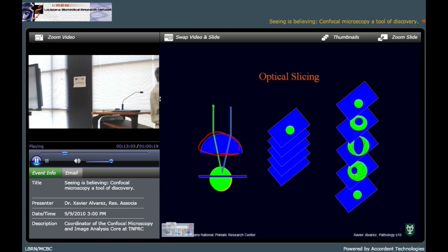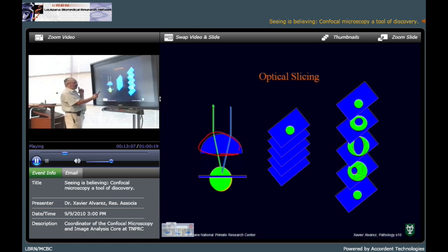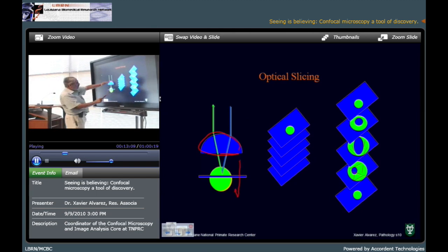It's going to shine, and then we move it around, and then this way too. Then we have one plane, and we go down on this. When we finish, we could separate the slices, and we have them like this: the top of the cell, something inside, the nucleus of the cell, the nucleus larger, some organelles, some lines. Then we are doing optical slicing.